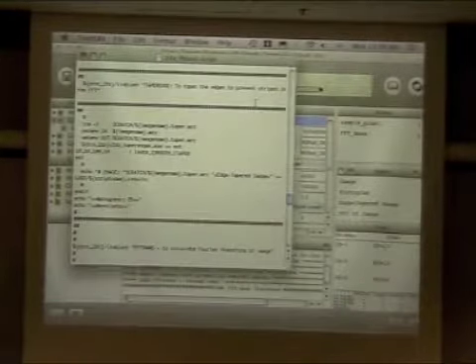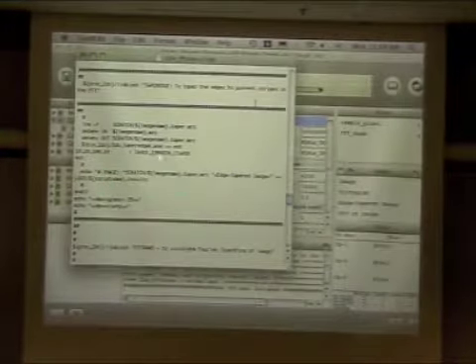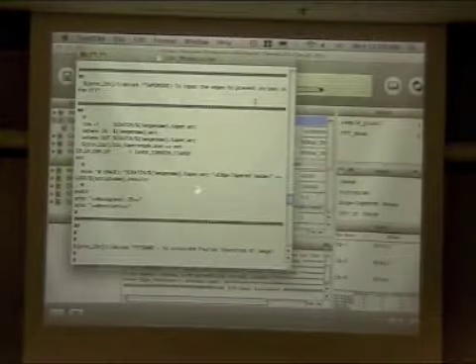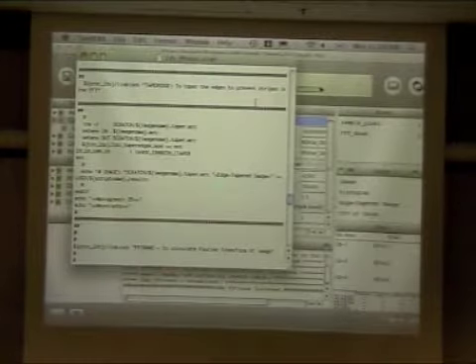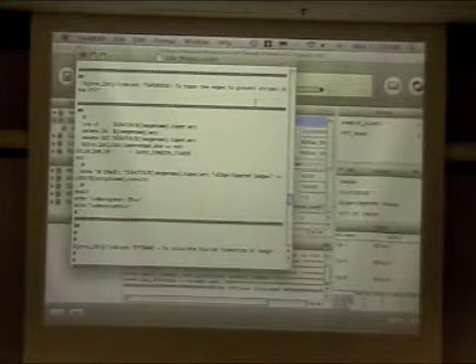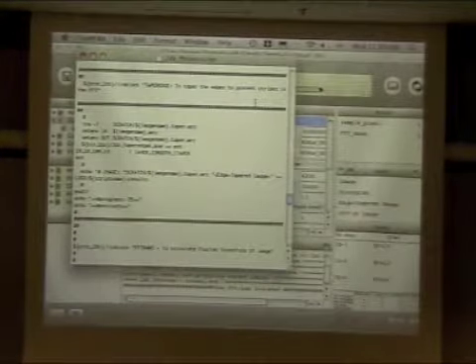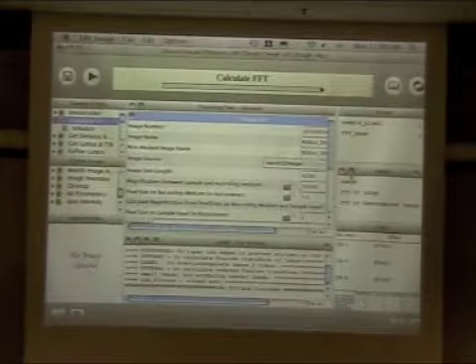So basically, you echo # image : the name and the location of your image in quotes, and then in these little angle brackets, if you want to put in something that appears. You see here in 2DX image, for instance, we've got image, histogram, FFT of image. Obviously, we haven't called those values just image and be done with it. It's actually called something a bit more complicated in this case.